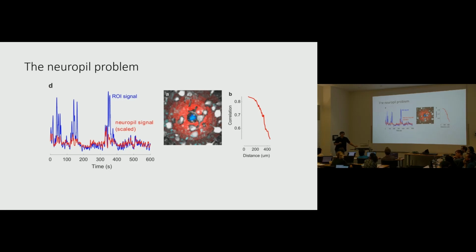Yeah, okay, so let's discuss here. One nice way of saying that would be background versus actual cells that are active? It's most likely their axons. I don't think there's a measurement to tell us that, but that's what people believe in the literature, that this background corresponds mostly to axons. Not so much to dendrites, because dendrites tend to be thicker. You can even see them by eye in your recordings. Apical dendrites are these dots coming in through. So we have a sense of what the dendrites look like. But people think it's the local axons of neurons in this area. So it's like the average activity of the neurons in this area.